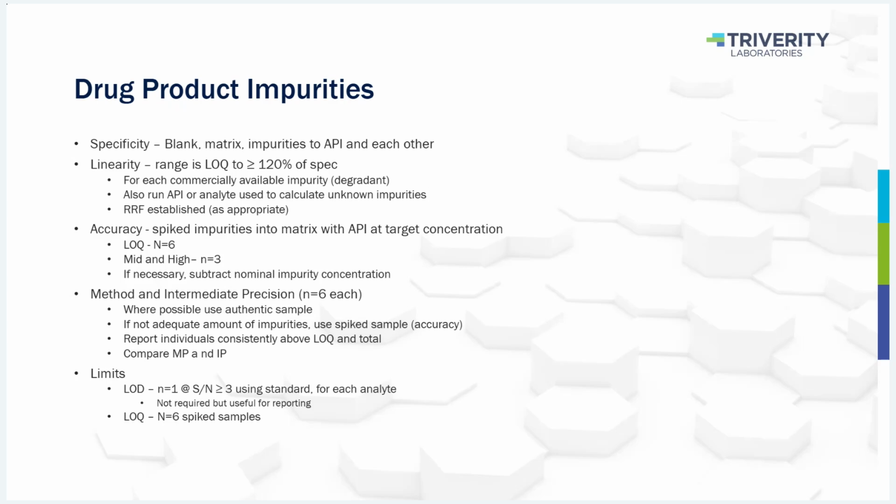One thing that we do when we do accuracy studies is we run an unspiked. Sometimes we'll run triplicate unspiked, and then we'll also run our spikes without any sample. And that just helps if something happens, maybe we had an error in a preparation, so we're not attributing poor recovery to a method failure. Maybe we had an error in preparation of our spike. So we tend to do that.